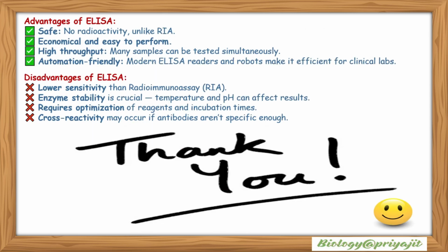The advantages of ELISA: it is safe, there is no radioactivity unlike RIA. It is economical and easy to perform. High throughput: many samples can be tested simultaneously in this procedure. Automation friendly: modern ELISA readers and robots make it efficient for clinical labs.